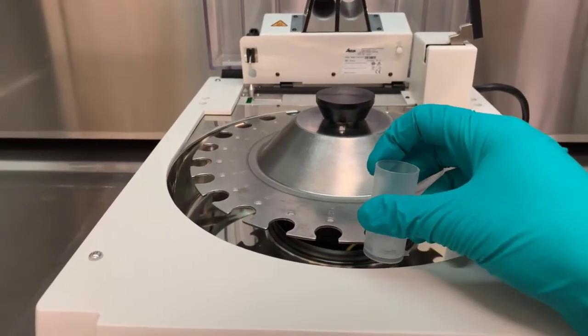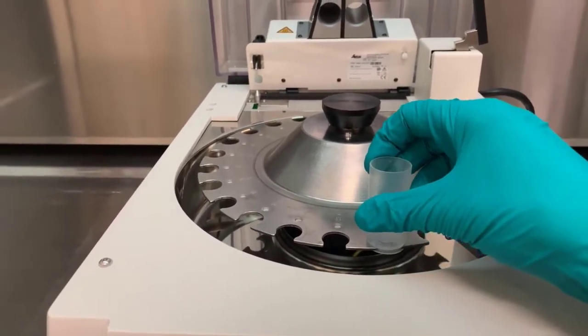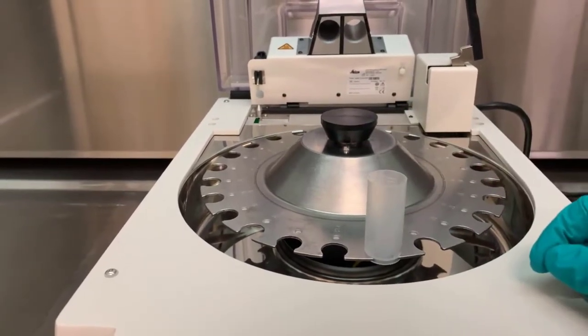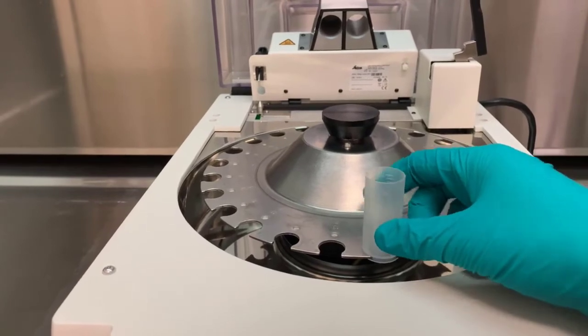They slot into place on the carousel of the EMTP. Each vial is twisted to be locked into place to hold it securely.